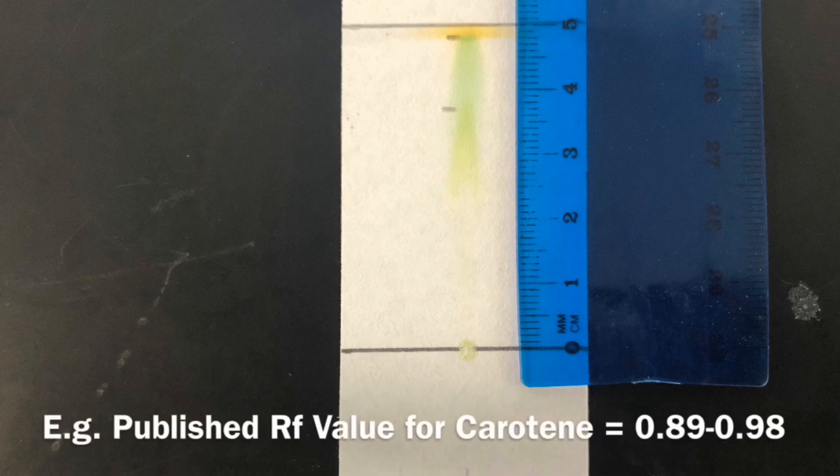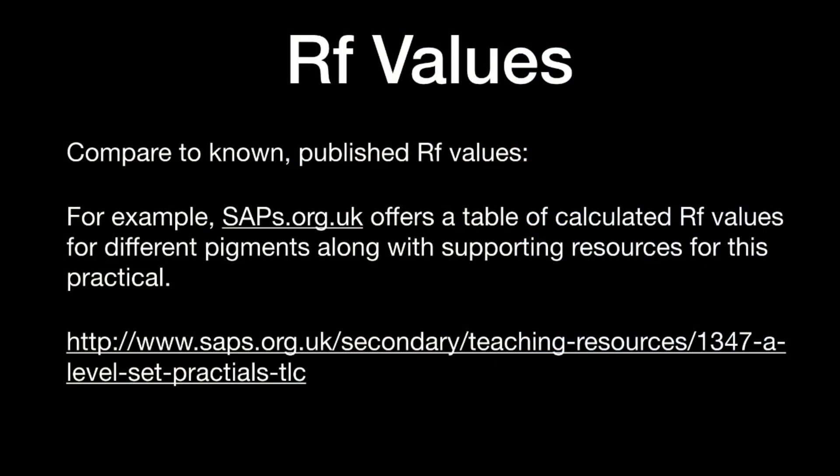For example, the published RF value for carotene tends to be between 0.89 and 0.98, and if you obtain a number within this range and the colour is yellow-orange, it's likely to be carotene. You can see it here at the top of the chromatogram, very close to the solvent front. Published RF values are easy to research and look up, with many tables available. This website also offers additional resources including the written protocol to help support you when carrying out this practical in the lab.